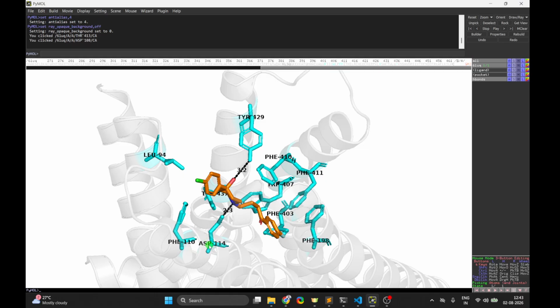As you can see, if you make a mistake in that one, you end up changing the structure of the cartoon representation, which is incorrect, by the way, right? So you have to be very, very careful. Just select those names when there is nothing in the background, and then only move them. Okay, do not change anything which should not be changed. It's really important, and this is something I want to change.